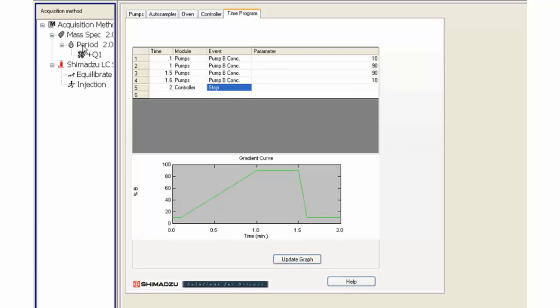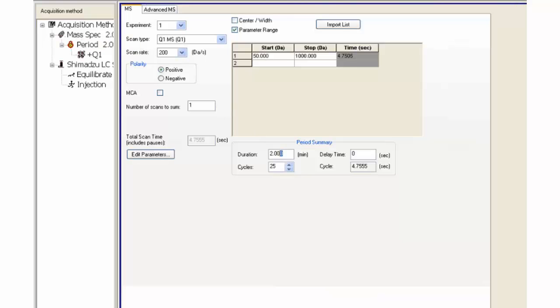Click on the mass spec option. Notice it has a time component. Confirm the duration to equal the LC duration. The time may change slightly because Analyst needs to round the time up to include total scan time.